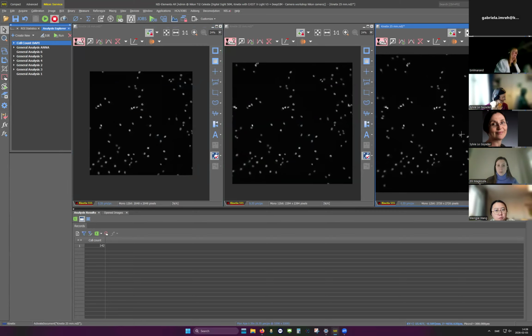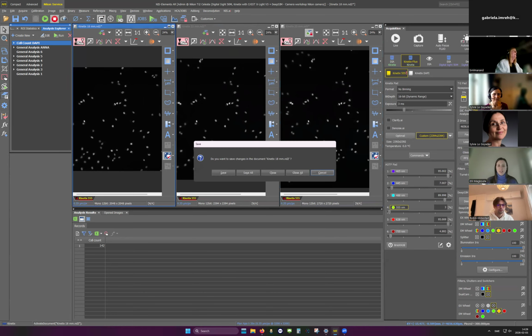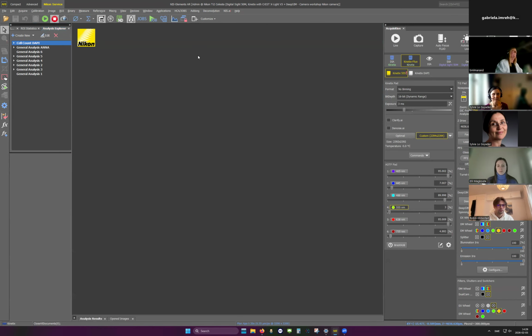So the size matters in this case, because if you want to capture, for example, 1,000 cells to get your correct statistical values, then it's better to maybe capture a few frames to capture more cells than going with a small frame. And I'm going to live show you this. For example, if you would like to do a live image, it can make sense to have a larger sensor. Now I need to move this and just open up my job.